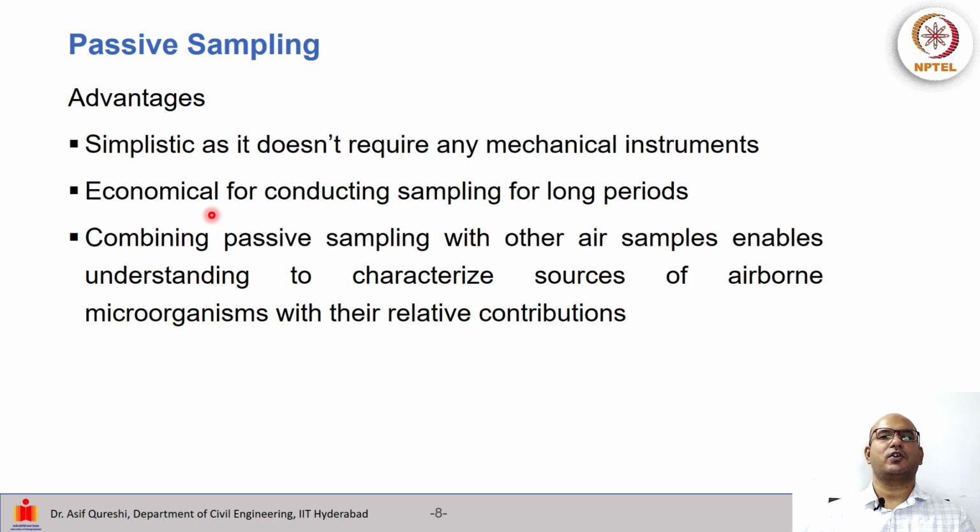The method is economical for conducting sampling for long periods, because we can keep the plate for as long as we want. We do not need to come every day. We do not need to send everyone every day, and we do not need to add anything. We can just prepare our medium on the plate and let it be there. So it is economical. You go put it and then forget about it, and you go and collect it after sampling and do your analysis. So it is economical for sampling for long periods.